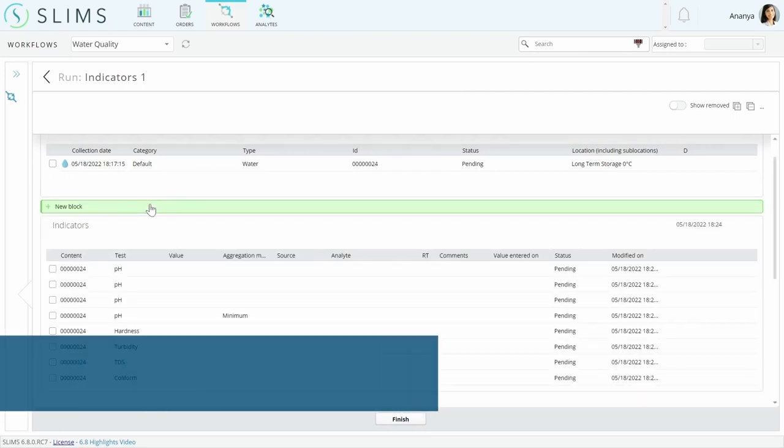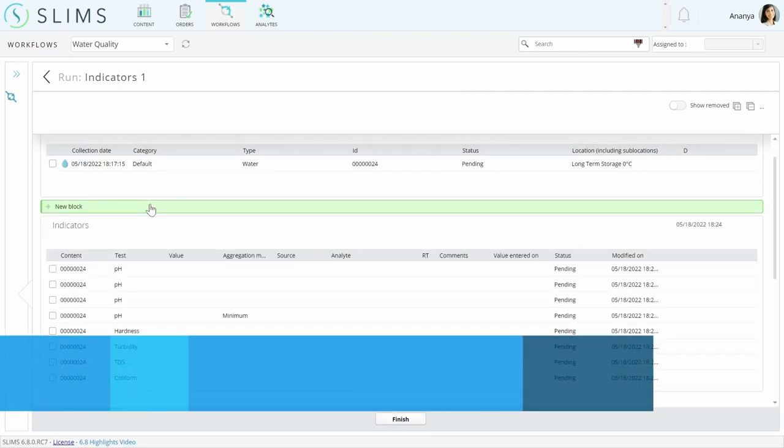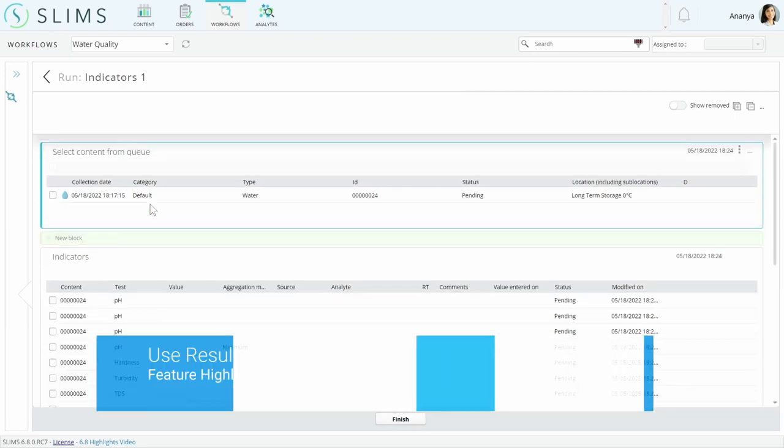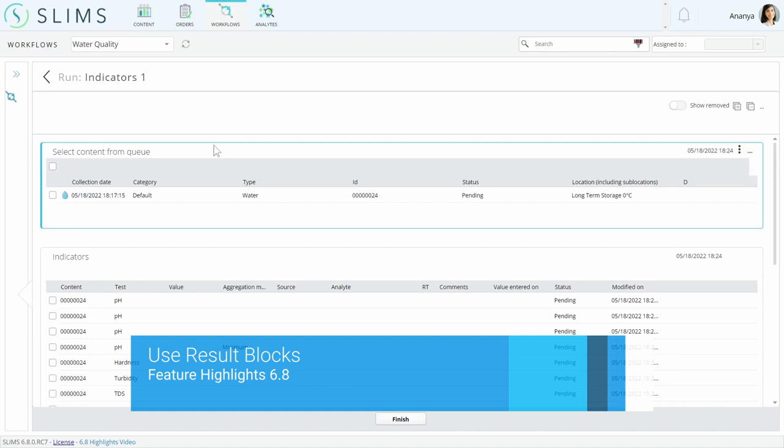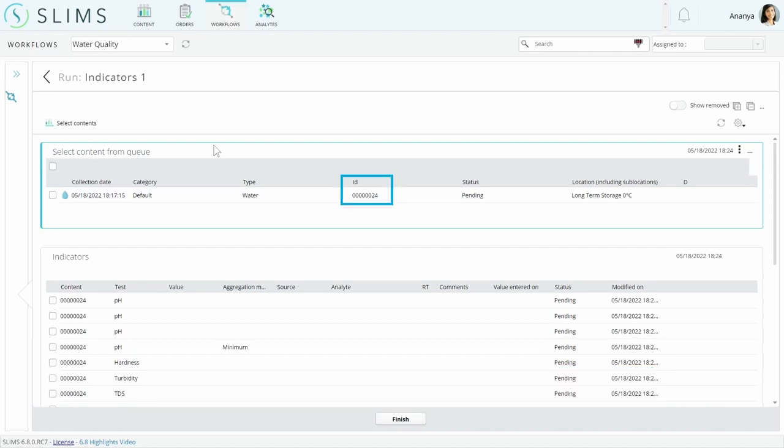Results can be collected in a results block in 6.8, which is a block that requires a linked content block. Here, we're using the workflow's select content from queue step so that any content in the protocol run from the order is linked to this block.